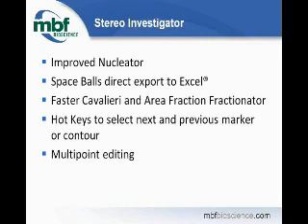Spaceballs, if you're using Spaceballs to estimate the length of objects within your region of interest, you can now directly export those results to Excel. And major changes have been made to speed up Cavalieri and area fraction fractionator. I think the numbers were something like a couple of thousand. This is something that comes from MBF Labs again. To do a certain operation repetitively was several thousand clicks, and we ended up reducing the number of clicks to like 12. So it was a big advancement. They could get a lot more work done in a shorter period of time, and not have sore wrists at the end of the operation, which was good.